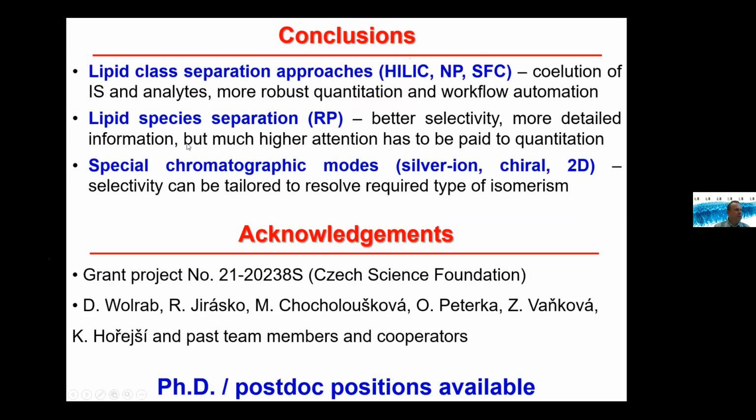So finally, I'm going to conclude my presentation. To summarize, I have tried to explain what lipid class separation means and what its advantage is for quantitation and automation of your workflows, but also what the limitations are and what the complementary advantages of lipid species separation are, with better selectivity and more identified species.